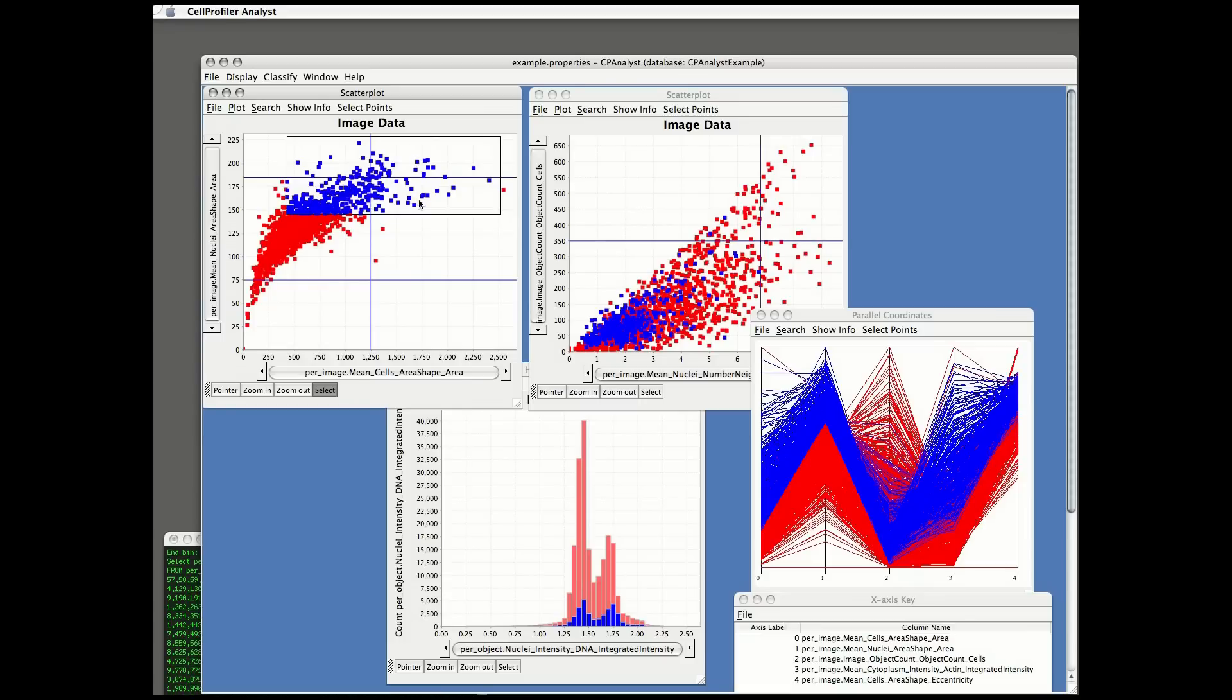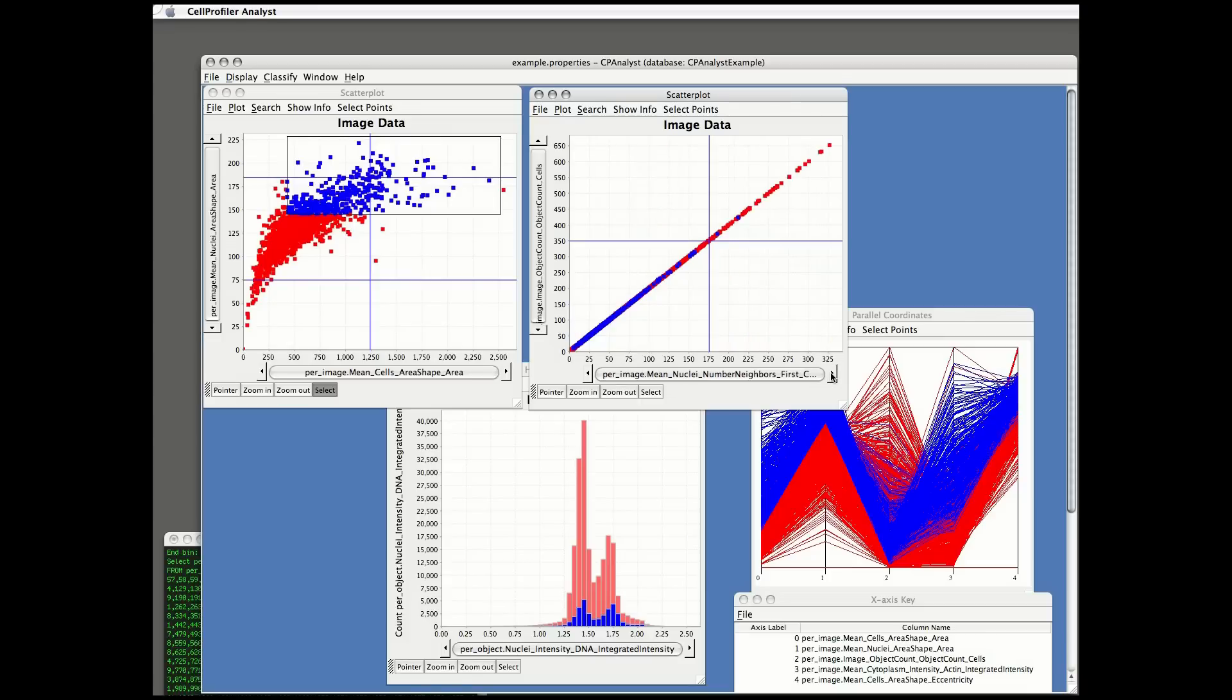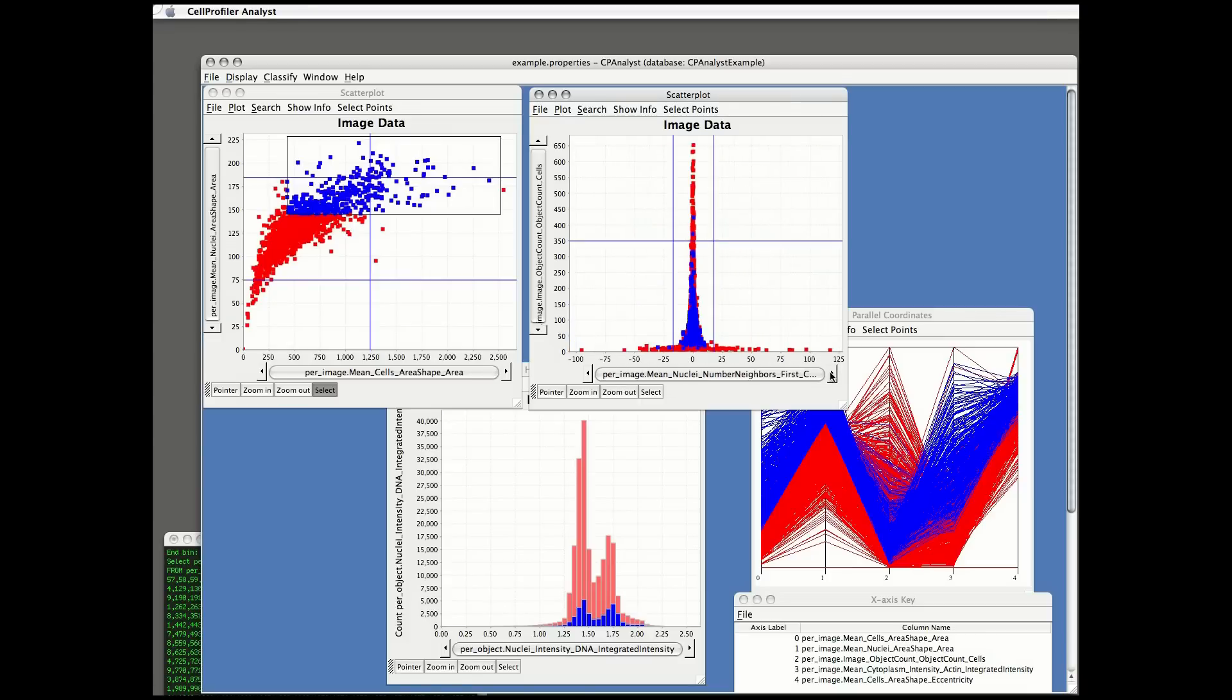I can further explore relationships between features by clicking the arrows in the axes to look at how other measured features look for the highlighted population and for the cells, the image populations overall.